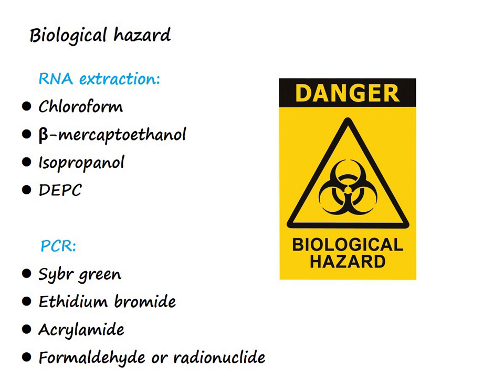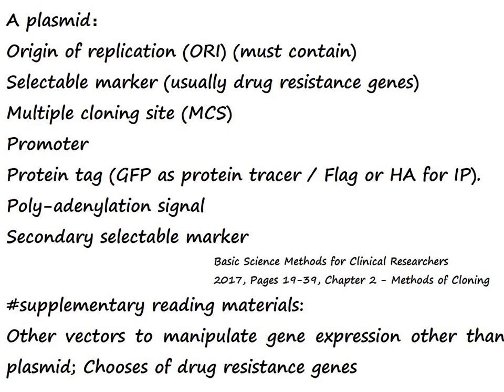Firstly, I'd like to reiterate the biological hazard. These organic solvents used in RNA extraction and the fluorescent dyes and radioactive dyes used in PCR are all toxic. Protect yourselves. We will start with the definition of a plasmid.